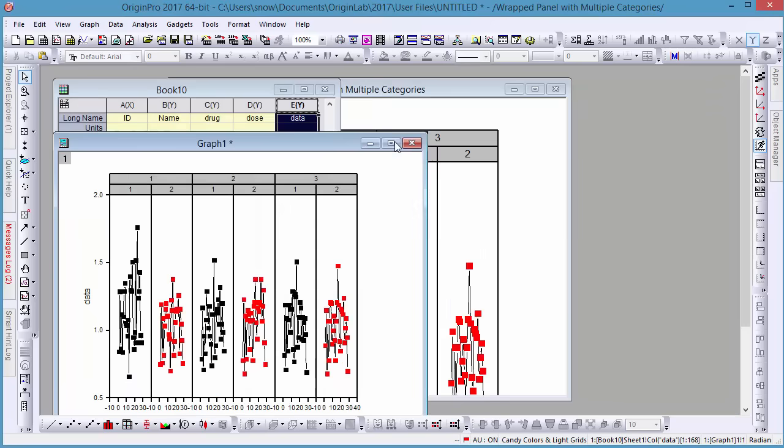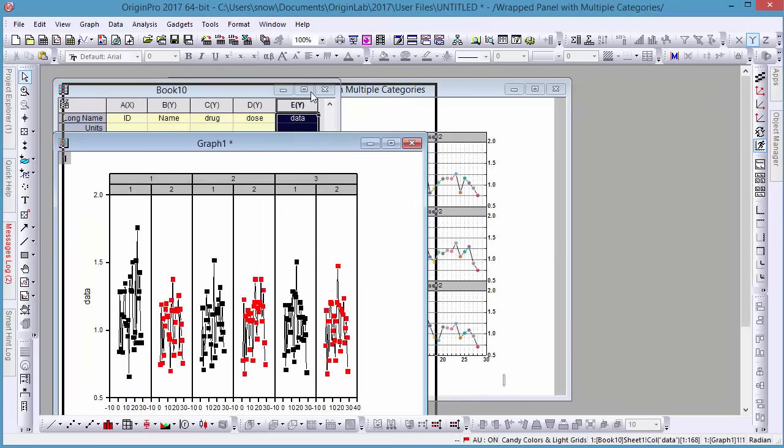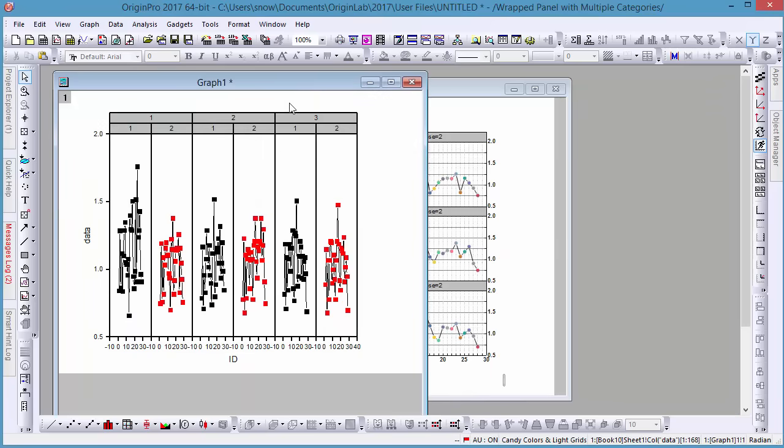This multi-panel graph is rendered as a single layer, so all panels share the same X and Y range. And in contrast with old grouped plot types, a Trellis plot will not create an extra datasheet with the plot.